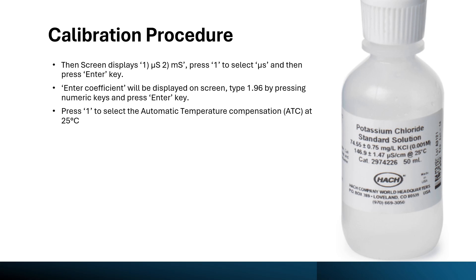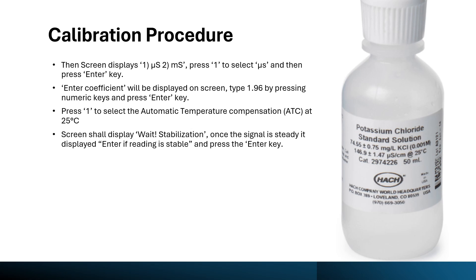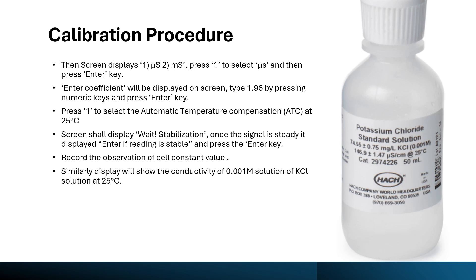After pressing enter there will be two options: option one for automatic temperature compensation at 25 degrees C, or option two for manual temperature. Press one for automatic temperature sensing. The screen will display wait stabilization and once the signal is steady it will display 'enter if reading is stable'. Once you get this message, press the enter key and record the cell constant value that appears on the display.